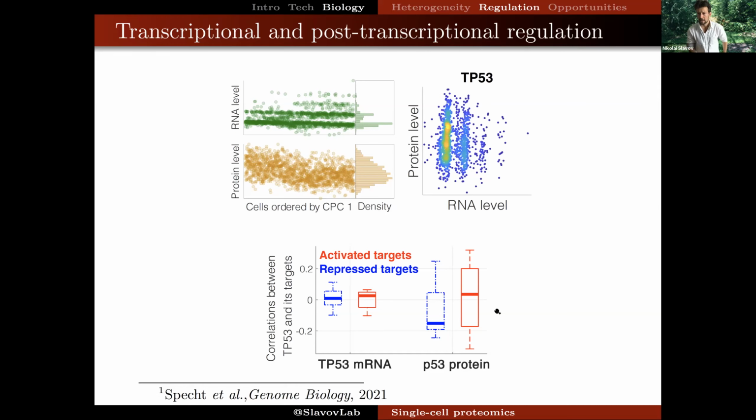And in this case, it's easy to hypothesize possible causes for that, which include the alignment of the data sets, post-translational modifications of p53, which we did not measure, localization, additional transcription factors that regulate those genes, and lots of other related factors. But I found this observation nonetheless encouraging, that we are able to measure more information about the regulatory activity of the transcription factor by measuring the protein abundance compared to the transcript level.